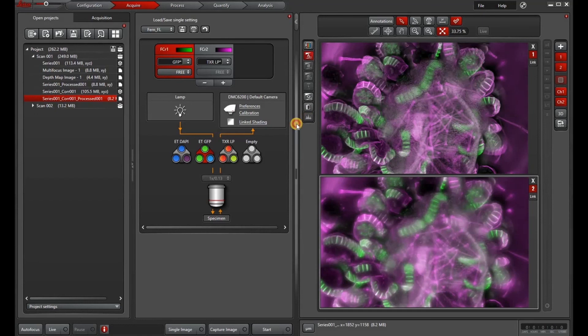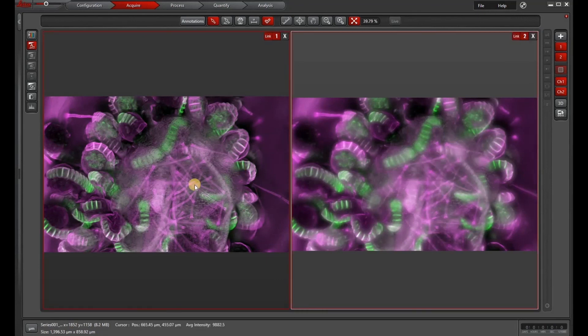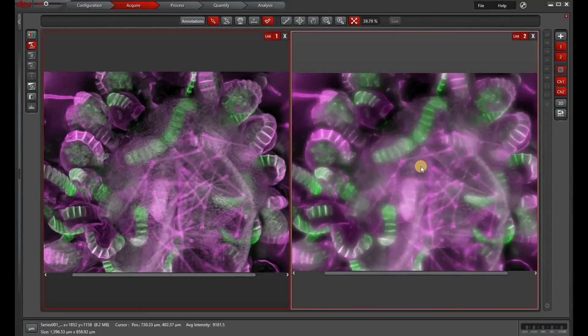So let's just compare our EDOF with the maximum intensity projection. So EDOF on the left and maximum intensity projection on the right.